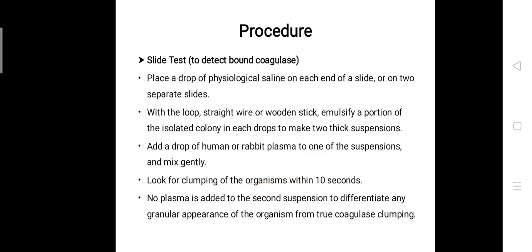In coagulase we have two methods: the slide method and tube method. First we will be discussing the slide method. To perform this slide method, you have to take a clean, grease-free glass slide and then divide it into two sections using a marker.